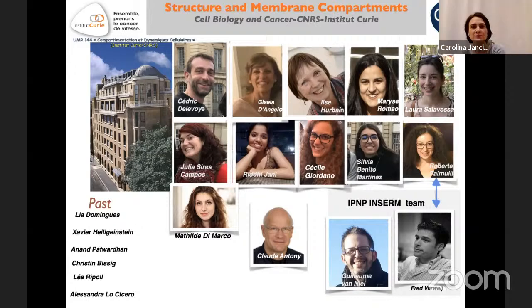Yes, he worked a lot on mycobacterium. And of course, you can also embed bacteria in gelatin, as we do normally for cells. You can embed the bacteria, and then you can do sections.